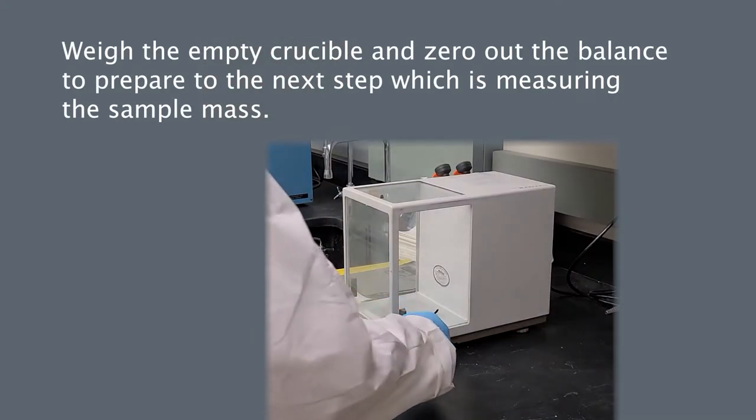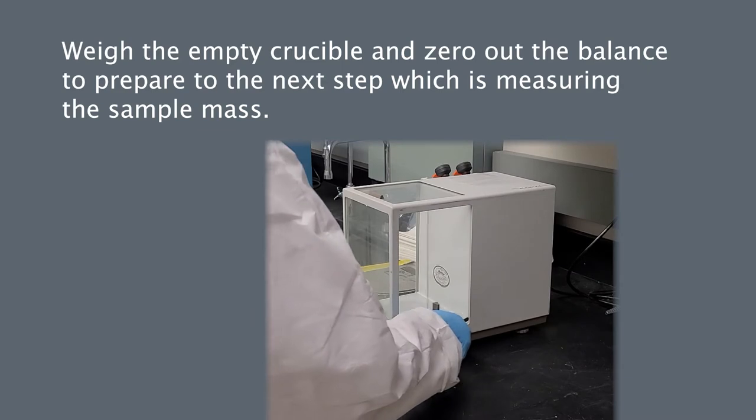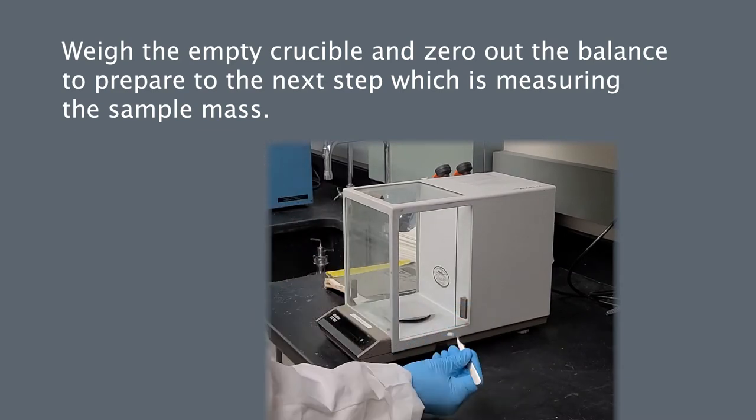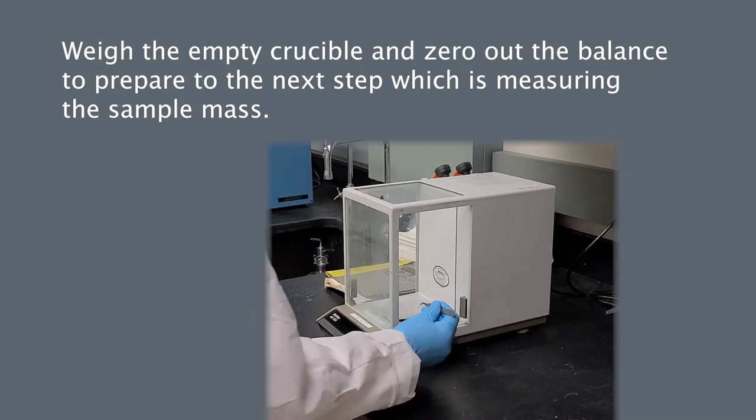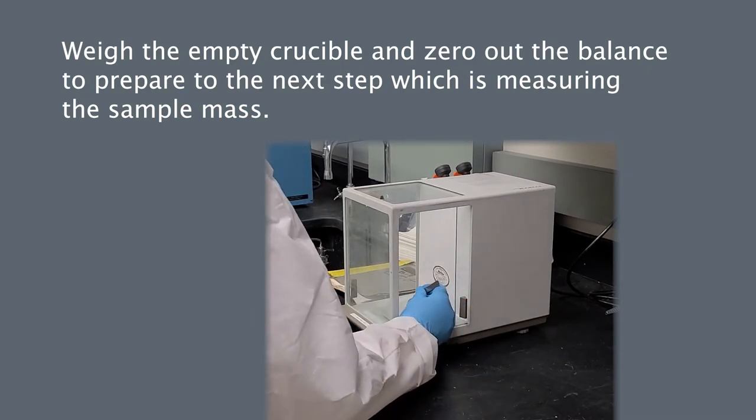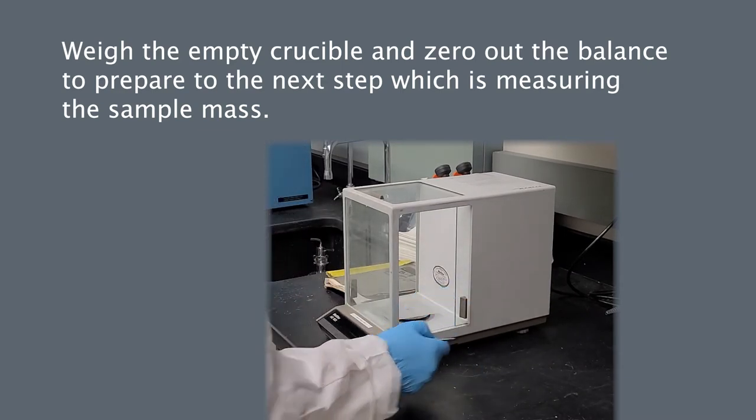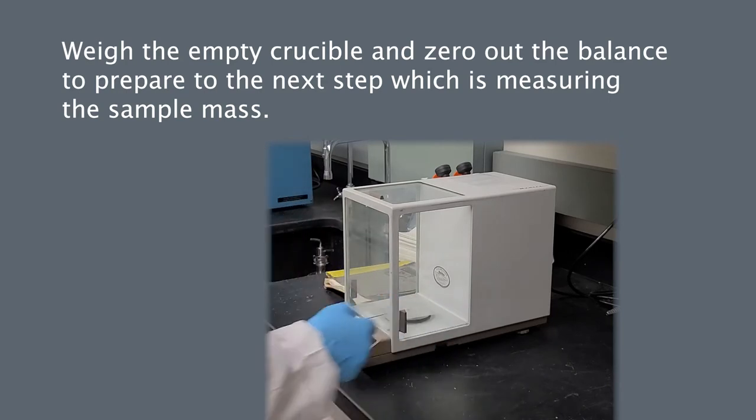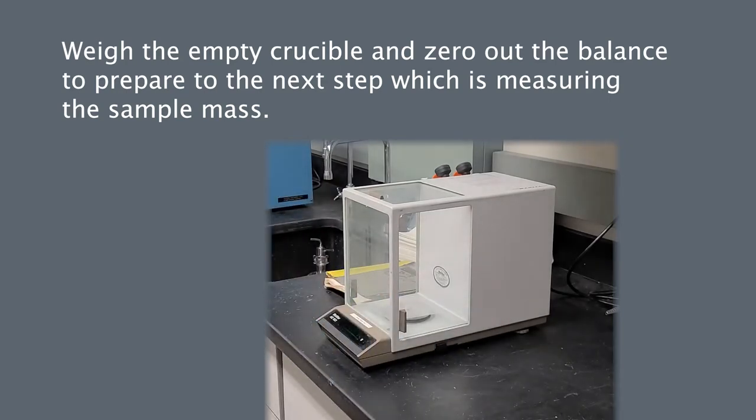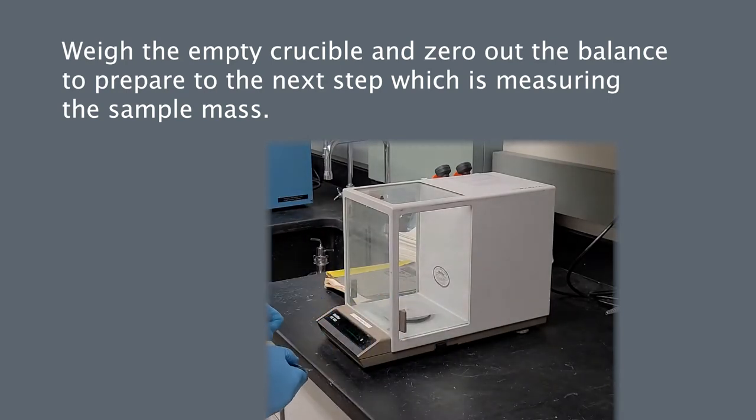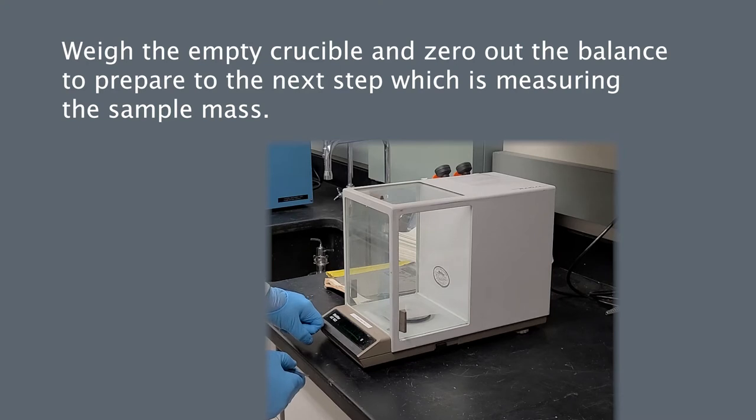Move the clean empty crucible to the balance and zero out the balance once the weight stabilizes. Each sample run in the instrument must be approved by the facility staff.